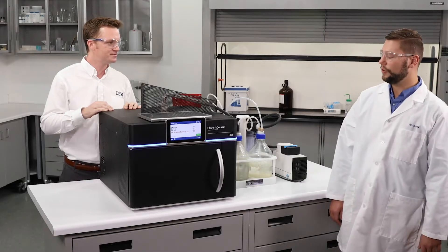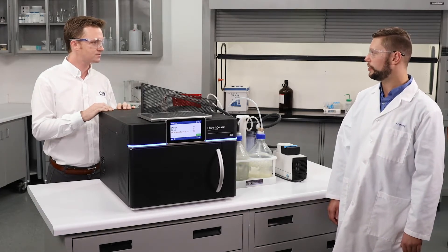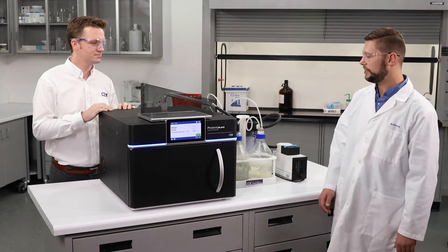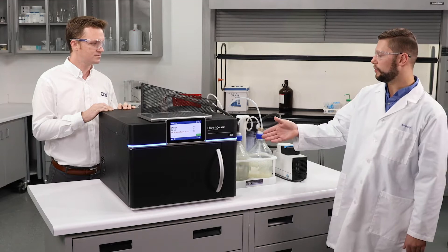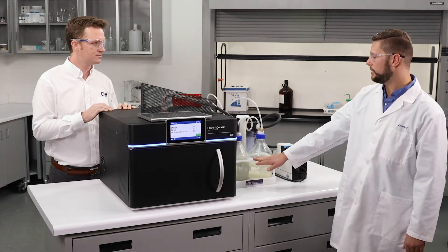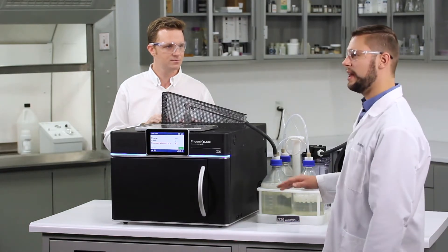So when we're running a sulfated ash sample we typically add some sulfuric acid up front which runs throughout the entirety of the test, and we want to take that acid vapor that's running during the test and put it into the scrubber system so that acid vapor is completely removed from the atmosphere during the analysis.